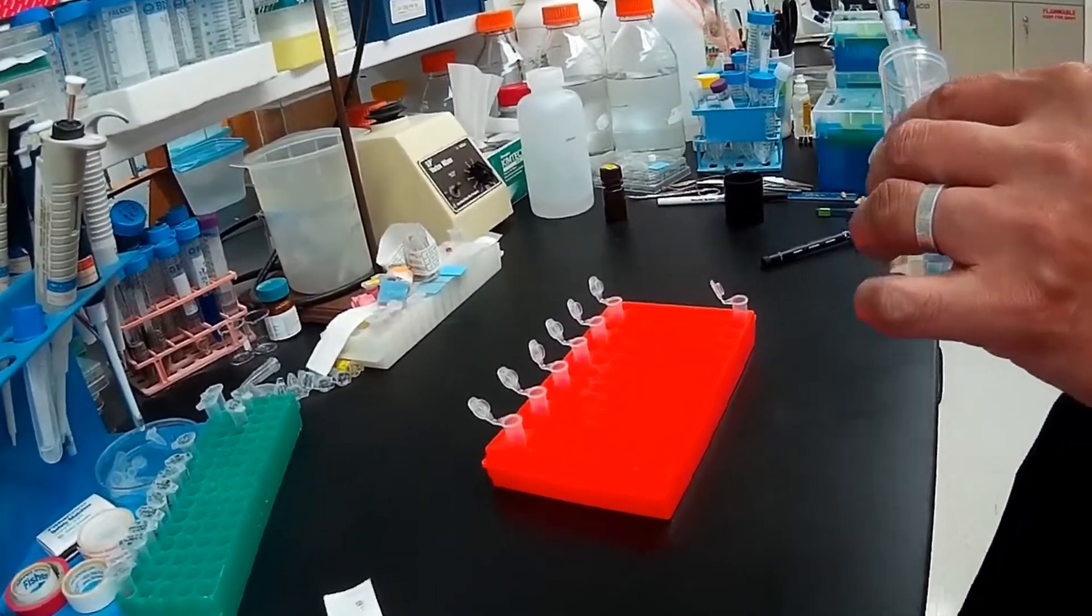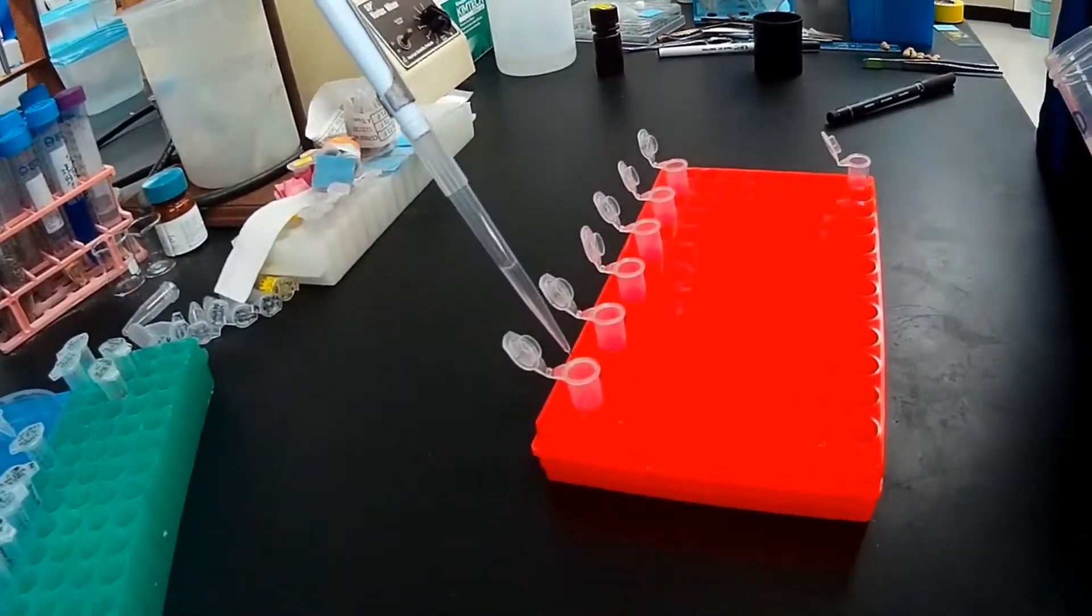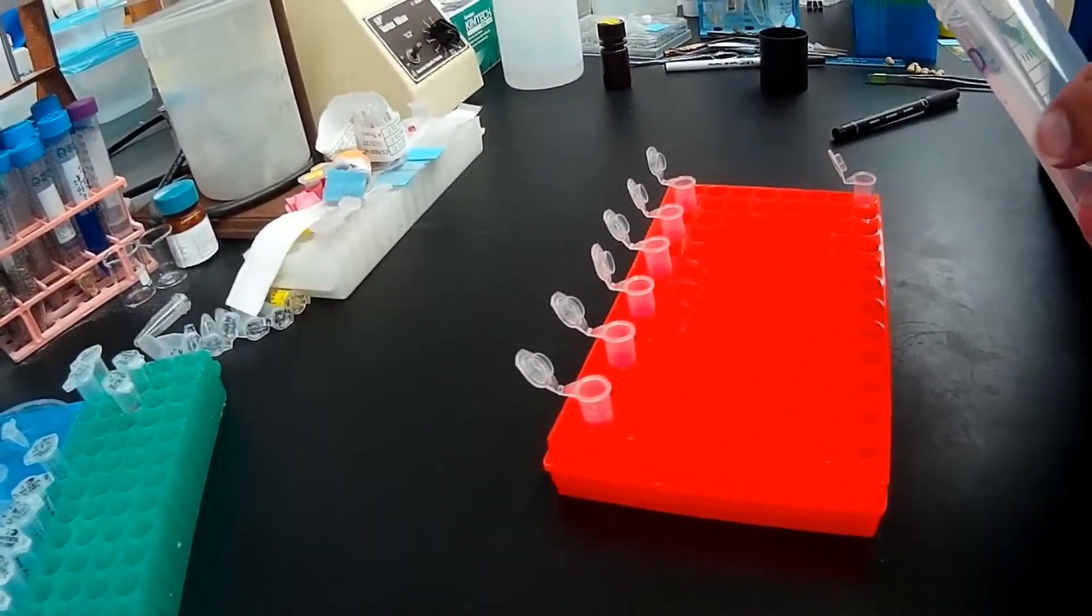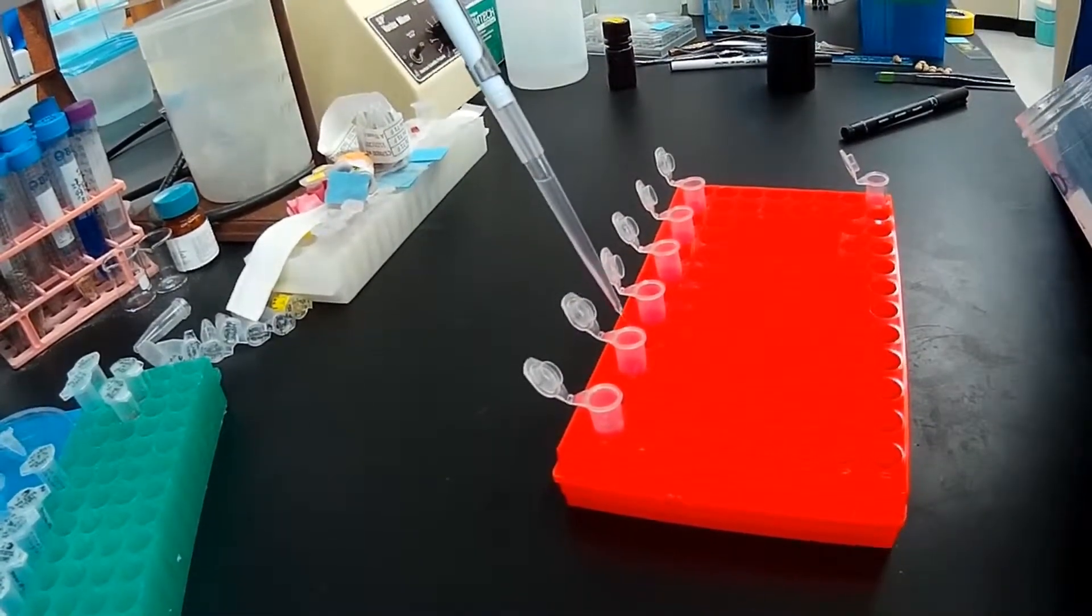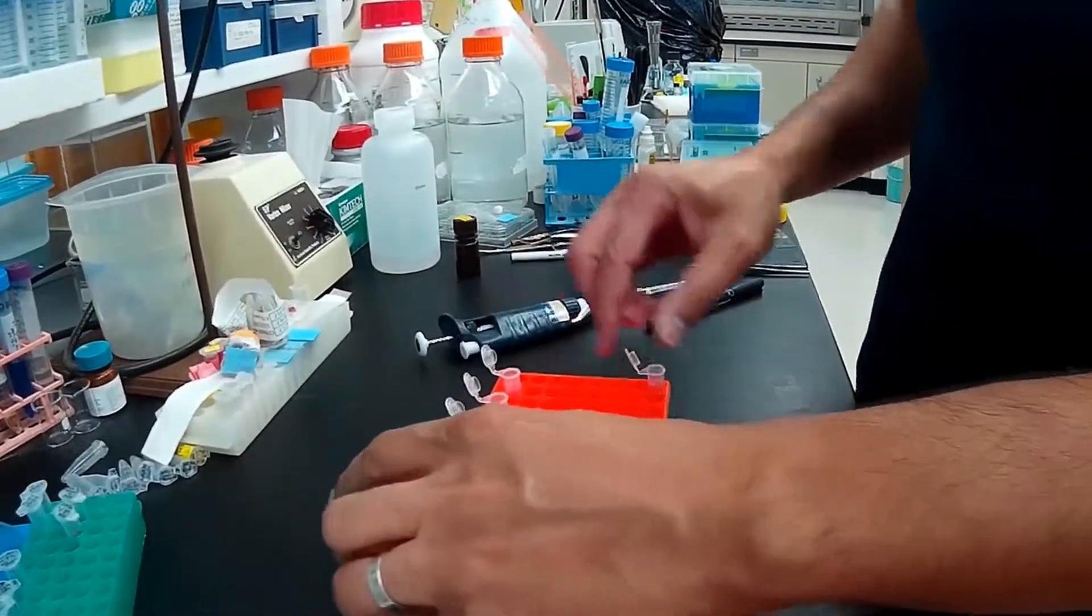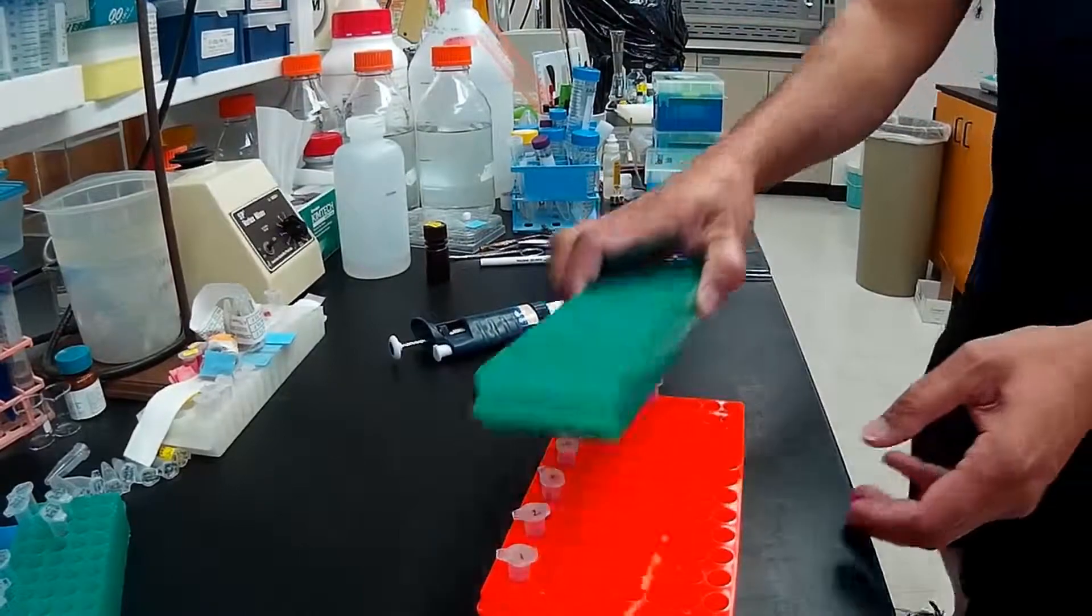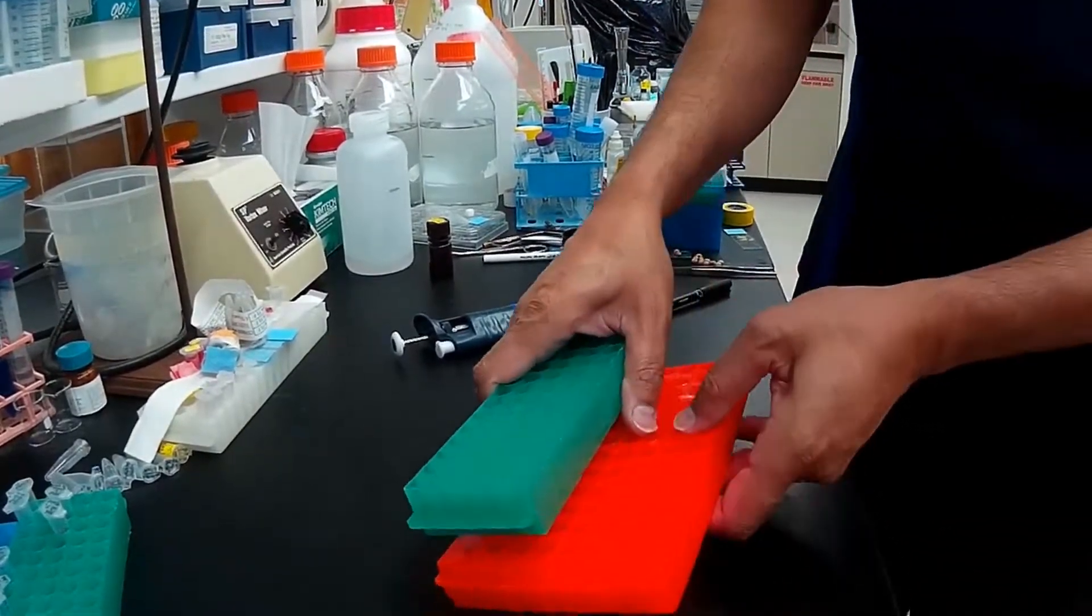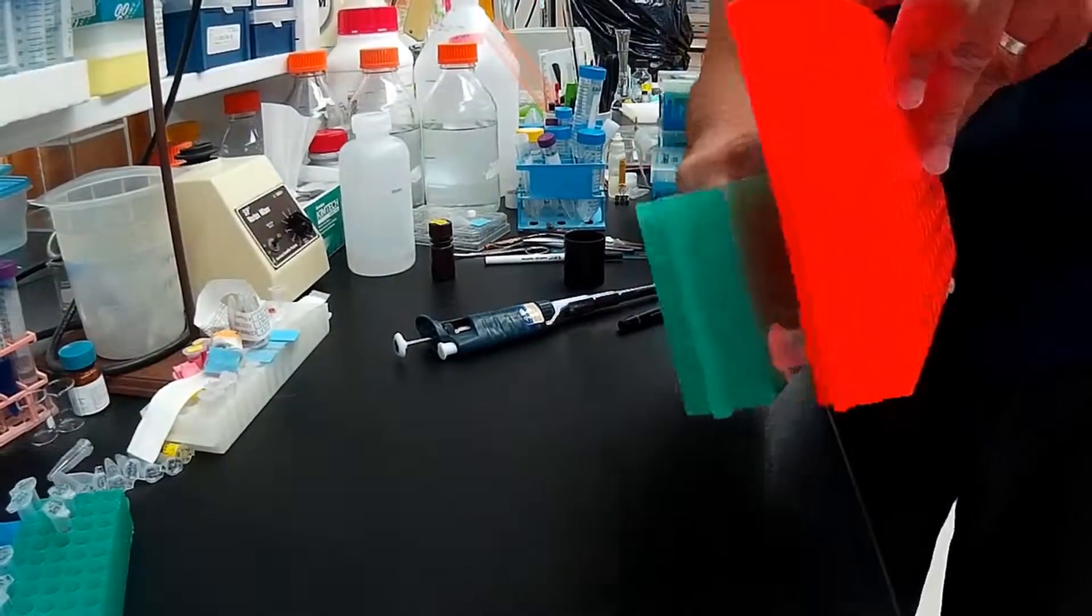Then wash the pellet with 70% ethanol by squirting it on the opposite side of the pellet. Invert our tubes gently a few times. Mix the 70% ethanol there.